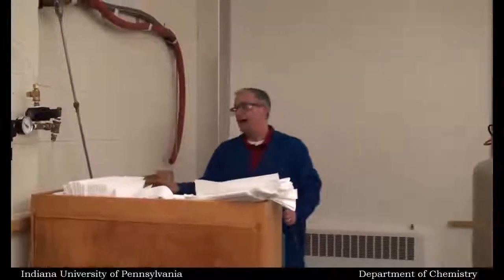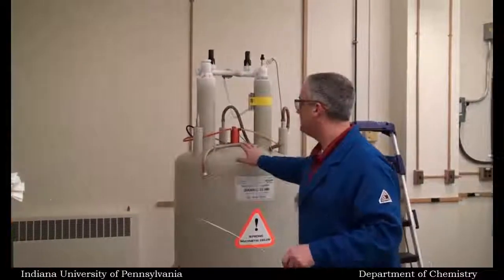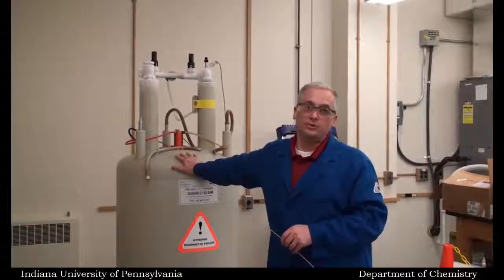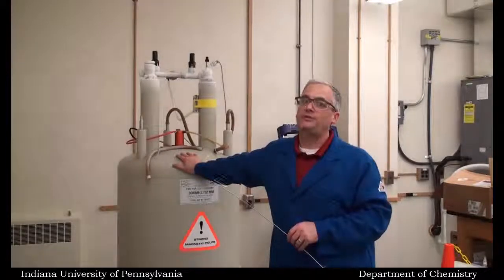Now you can get down to 68 centimeters and it is still safe. All right, 68 centimeters is still safe. Right now, this instrument was filled 4 days ago. So how often do you have to fill this? My typical rule of thumb is you fill the instrument every 5 days. You really should do it every 6.